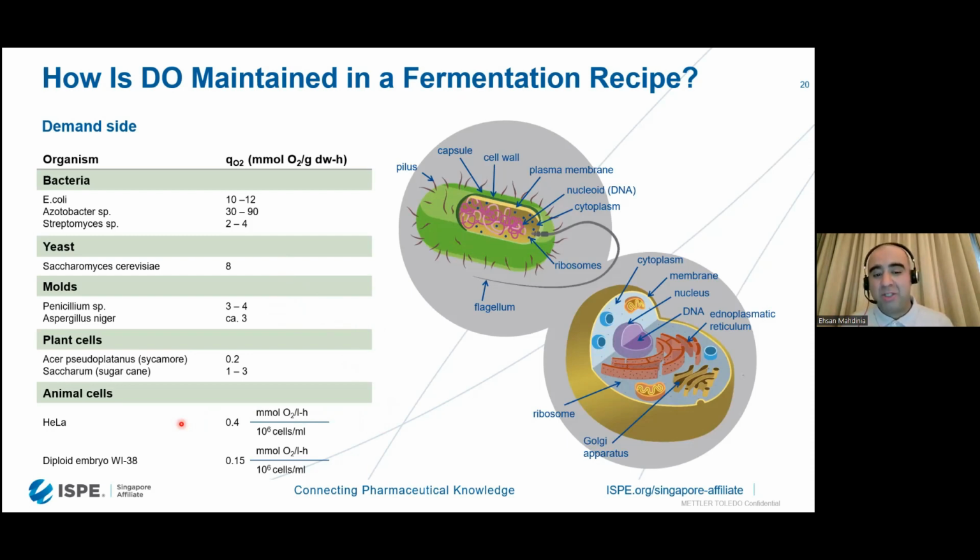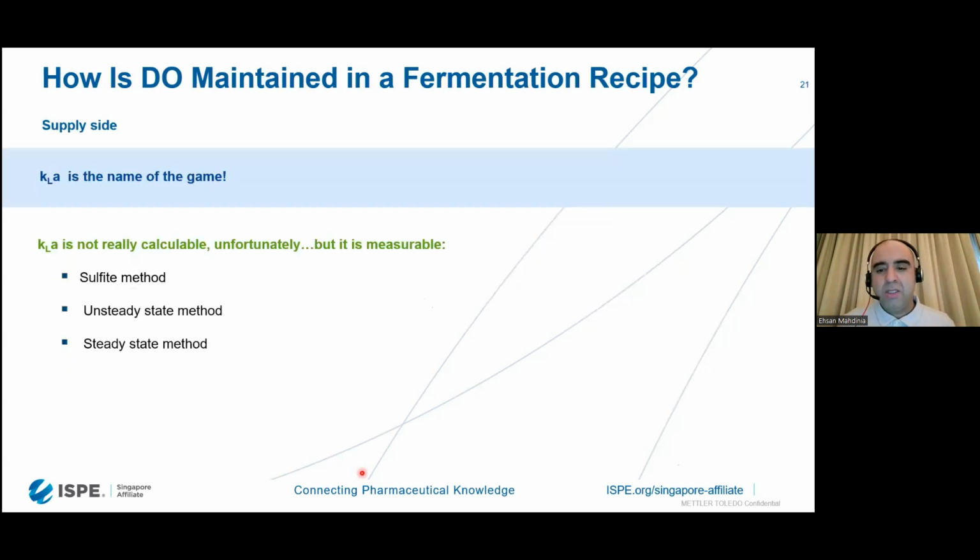It's just as oxygen hungry, but now it's so slow that we really have time to provide it with the oxygen, right? So for CHO, for example, which is the E. coli counterpart in cell culture technologies, the doubling time is at best 22 hours. So every day they're doubling, not every 20 minutes or 15 minutes. So their slow metabolism then gives us the chance to provide the oxygen.